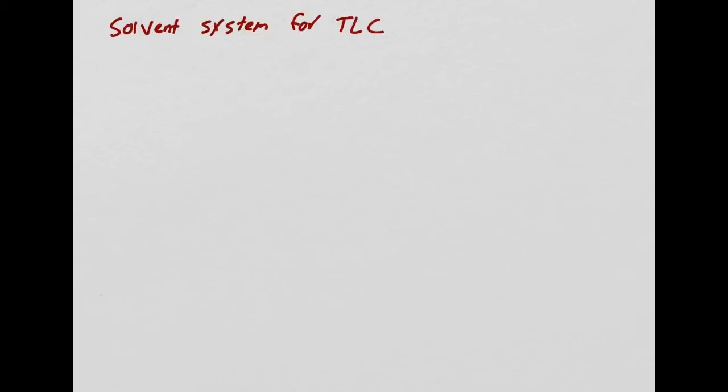So I'm going to be better than my mom in teaching you. Please don't ever tell her that I said that. Let me teach you what I mean by a good solvent system for TLC. So to find a good solvent system, first of all, it is trial and error. You just have to try different things until you get a hit and you find one that is good for your system. Let me write it down.